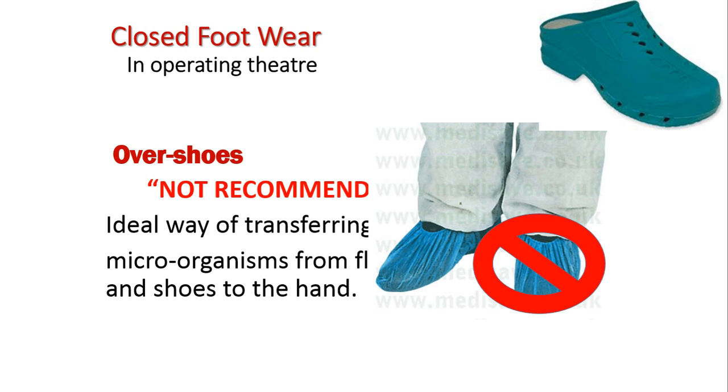Next is closed footwear. So we can use shoes, as you can see in the diagram. However, shoe covers are not very much recommended, though many people are using them. But if closed footwear is not available, then we can use shoe covers.